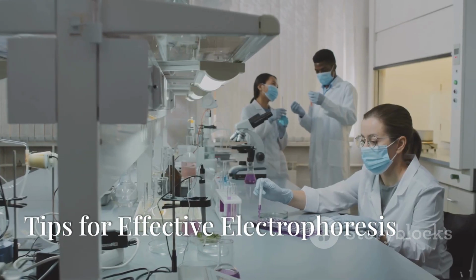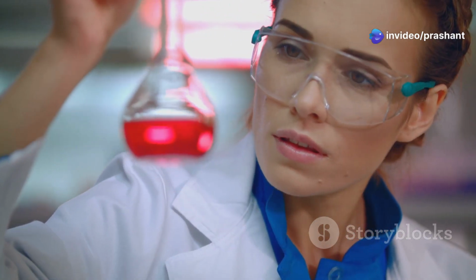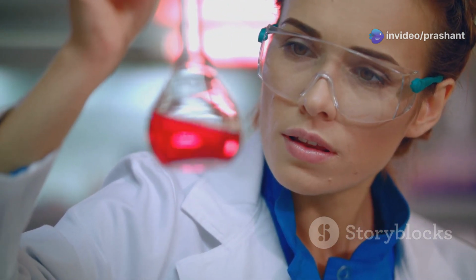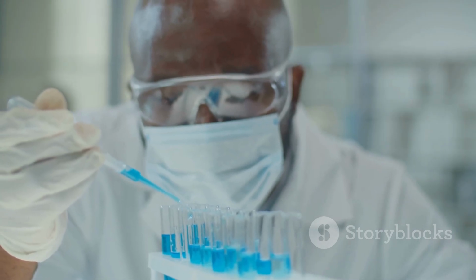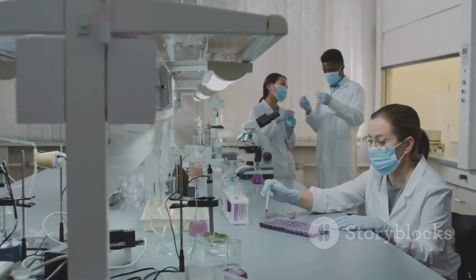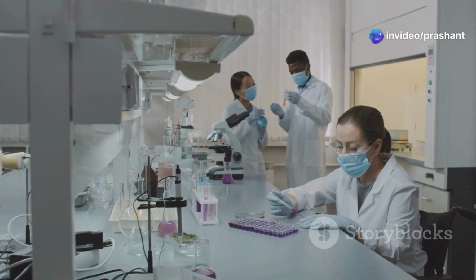Here are a few tips to keep in mind if you're working with electrophoresis in the lab. 1. Always check the gel concentration. It should match the size range of your molecules. 2. Use fresh buffers to ensure consistent results. 3. Make sure the sample is properly loaded into the gel to avoid distorted bands.